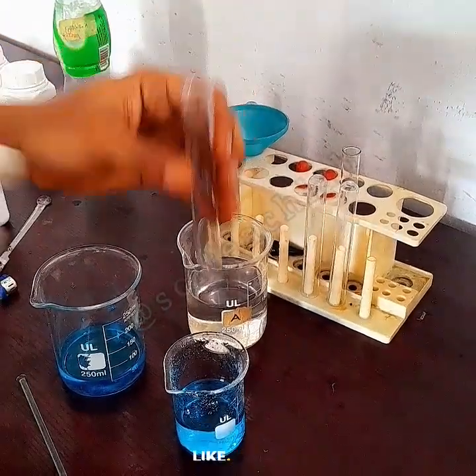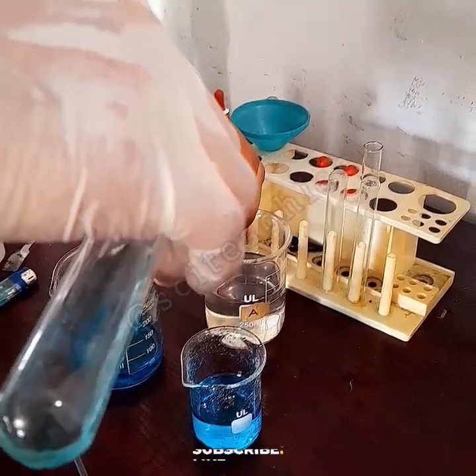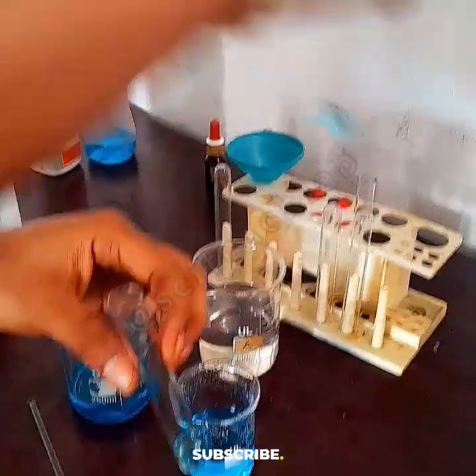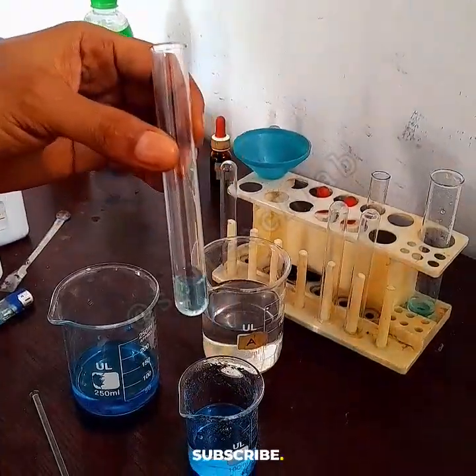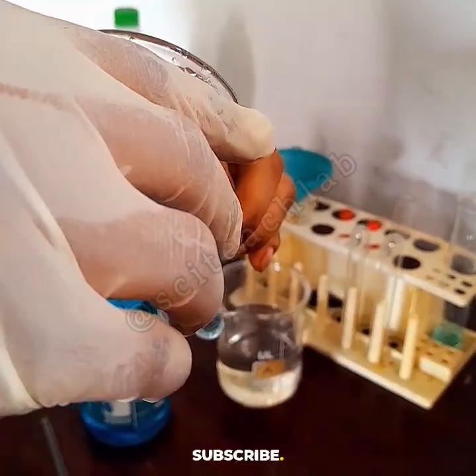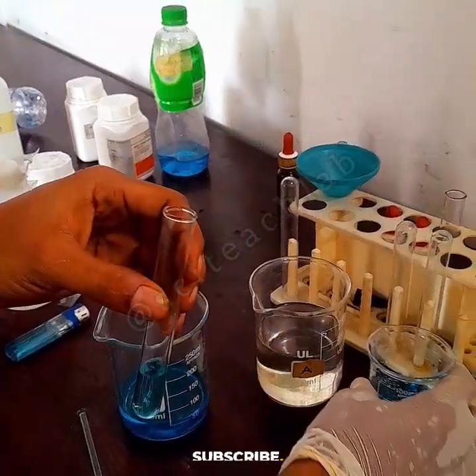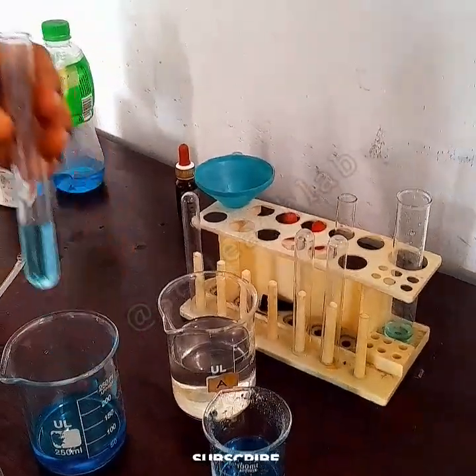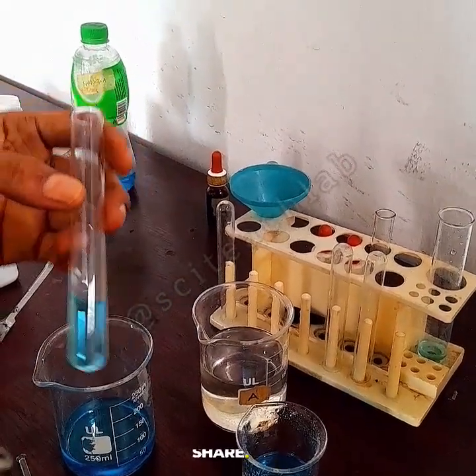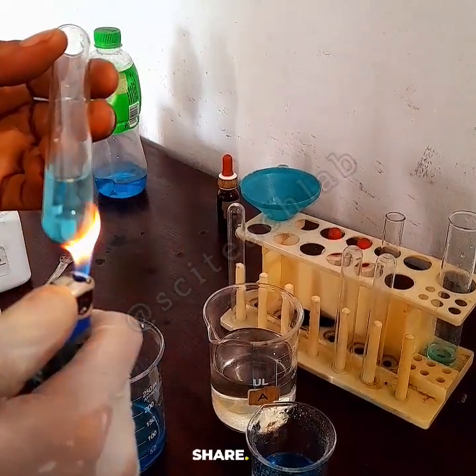Fehling's solution is what I will use in carrying out this test. So I get my solution of C, that same C we prepared from the beginning, and pour a little out into another test tube. Okay, so I've poured solution C into another test tube. I'm going to test using Fehling's solution, so I add my Fehling's solution into my C solution. Nothing happens. Nothing should happen until you warm it. So I'm going to warm it, and then you will see what will happen.